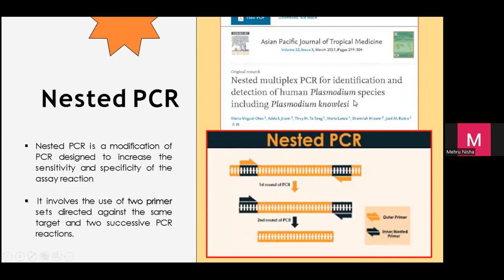This has been used dalam bidang malaria. Pernah guna, they have also used example lah. Okay, how it works? Andai kata ini adalah malaria dari monkey species kan. Okay, you ada dah. So you put primer A, primer B. Bila buat PCR, you dapat yang besar ni, amplicon besar. So yang ni dapat sini dah. So ini pelajar punya amplicon, results dia kan.